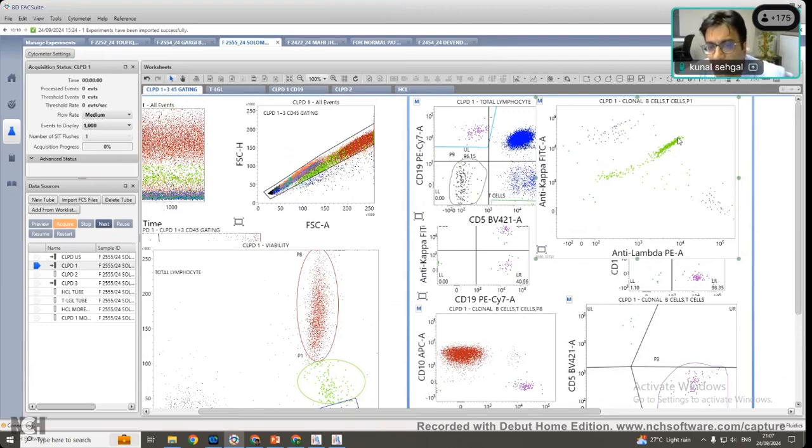Now, normal monocytes express kappa and lambda. Sometimes people call it non-specific binding. Actually, it is not non-specific. It is specific binding because monocytes express a receptor called the Fc receptor. The Fc receptor is what binds to kappa and lambda. And because the Fc receptor is common for both kappa and lambda, both bind equally, so you get 1:1 binding. So even if I don't have normal B lymphocytes, if I have monocytes in the center, I can be very confident kappa lambda has worked.